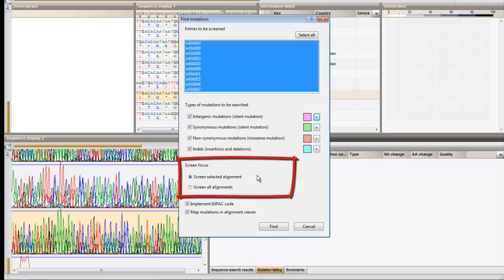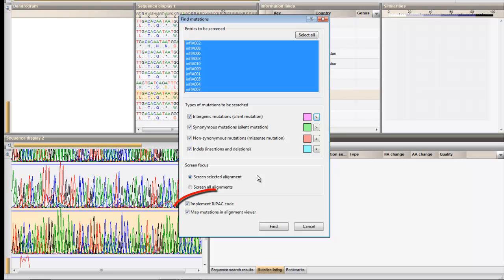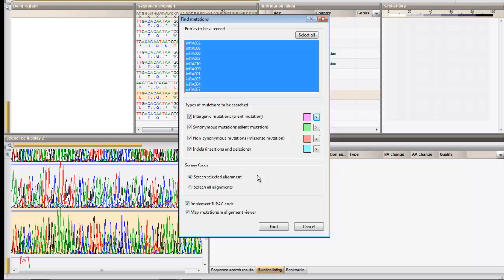Here you can specify if only the present alignment should be screened or all alignments present in the project. If implement UPAC code is checked, Bionumerics will score mutations in a conservative way. Ticking the last box will indicate the positions of the mutations in the display panels.